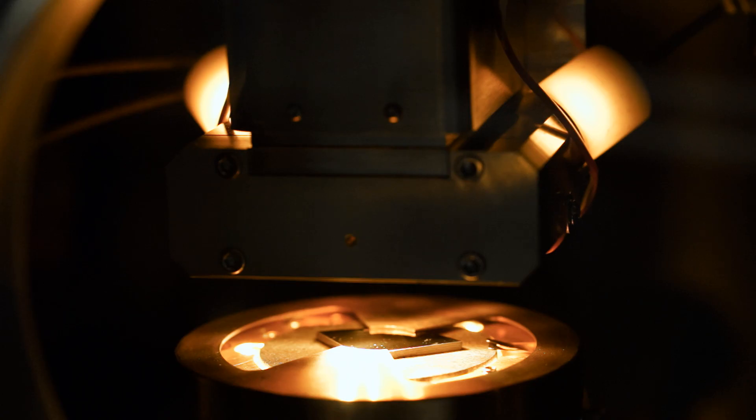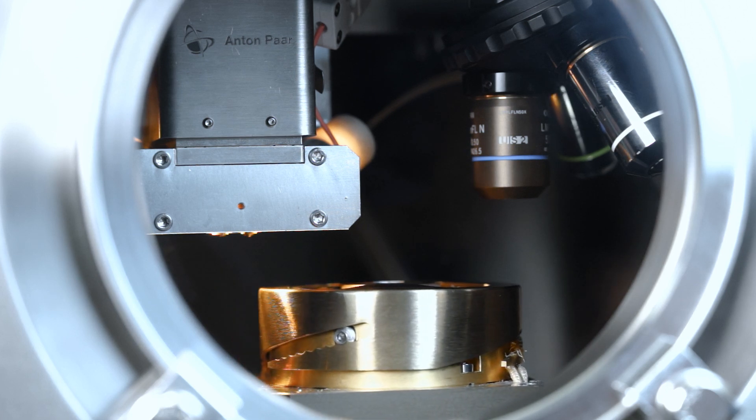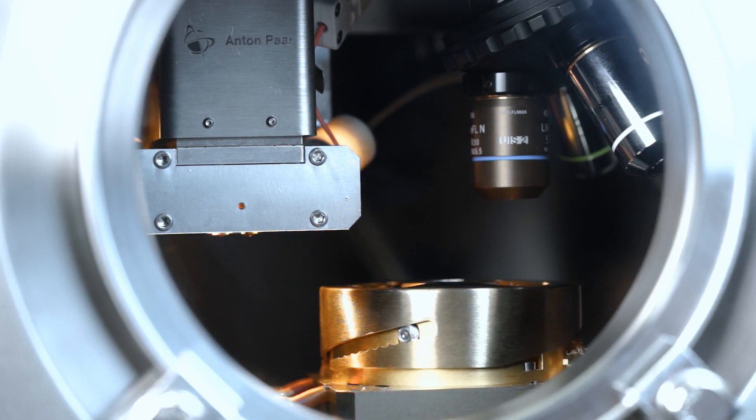Before and after nano indentation tests, the sample can be moved under the video microscope for visualization of images under vacuum.